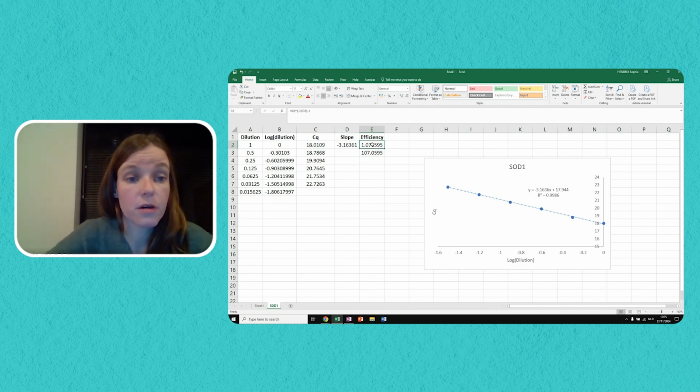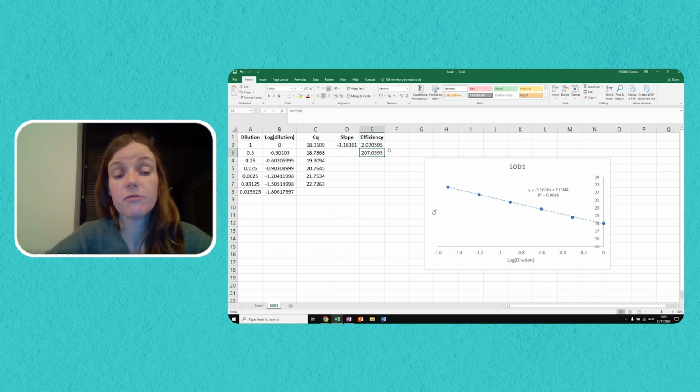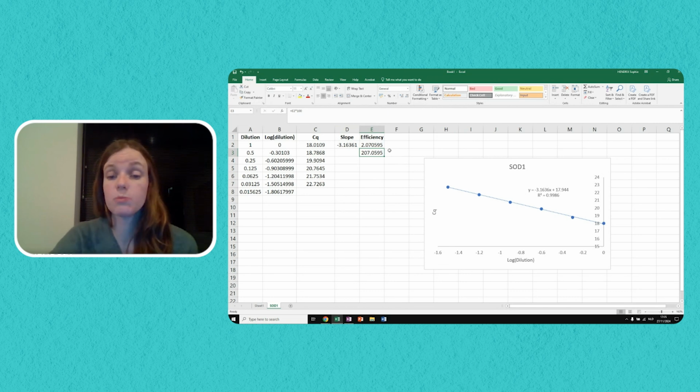What you will be able to see is that if you remove this minus 1 at the back of this primer efficiency calculation, you will obtain a value that's very close to 2. And this 2 indicates the fact that with this primer pair, the amount of amplicon is doubled in each PCR cycle. So it's doubled, so this means it's amplified by 2, hence the number 2.